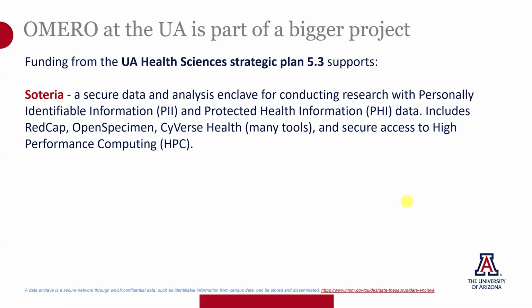Soteria is a place for people that need to work with personally identifiable information or clinically relevant information that has patient information embedded in it. Within that, you can use REDCap, Open Specimen, which is a biorepository software. The tools from CyVerse have been brought into that so that they can be used, and they call it CyVerse Health. And there's also secure access to the high performance computing. So if you're working with clinical data, this is a resource, and really a unique one because it's one of the first in the country to be like this.